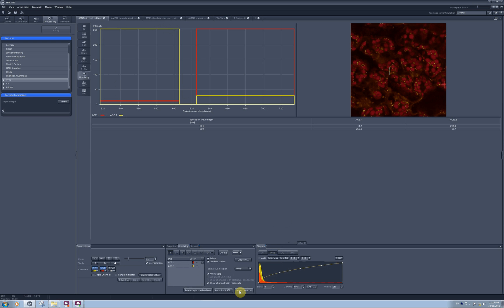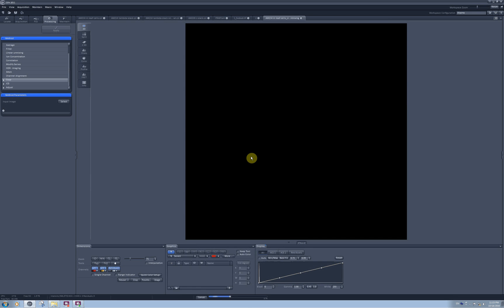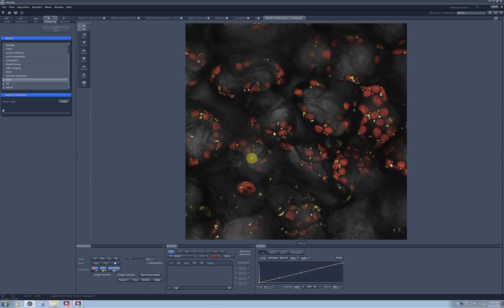To perform unmixing, I just need to click on this button linear unmixing and I will get a new tab with an unmixed image.